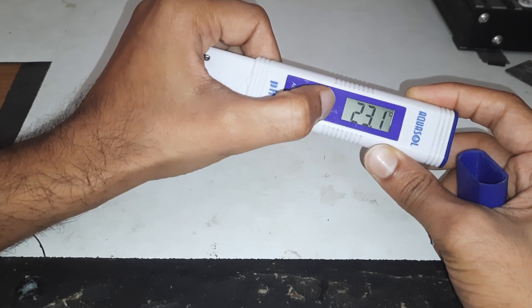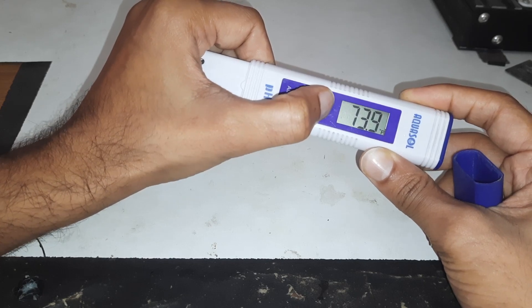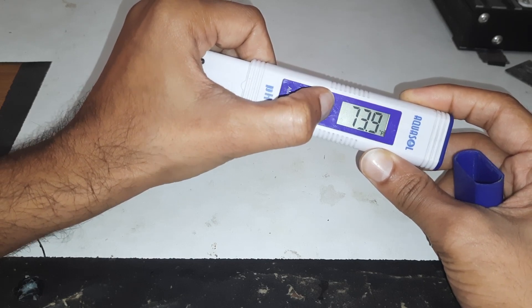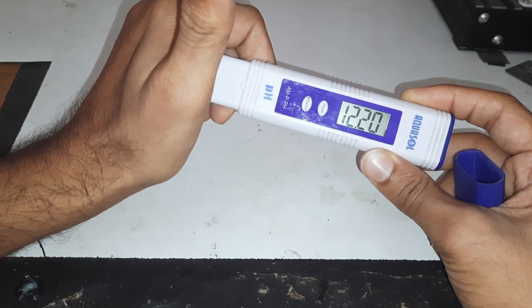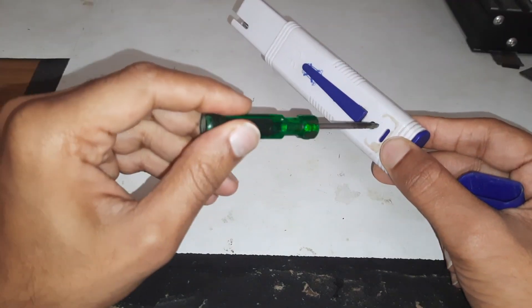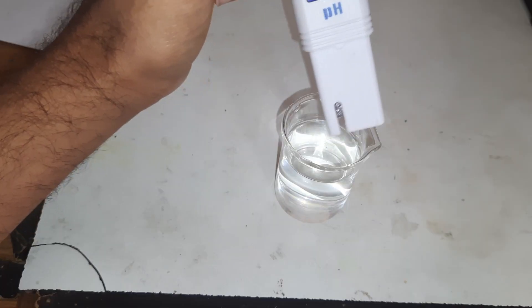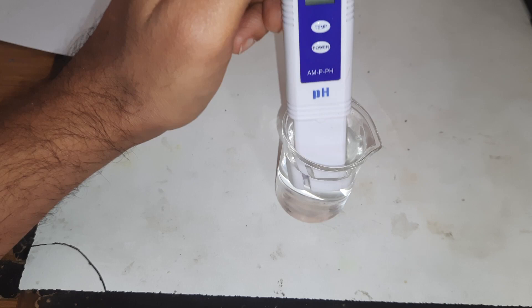It can be set to Celsius or Fahrenheit. After clicking three times it shows the pH value, and after giving a tap it's set to zero. There is a potentiometer to fix the values. Let's test the pH of the filtered water.